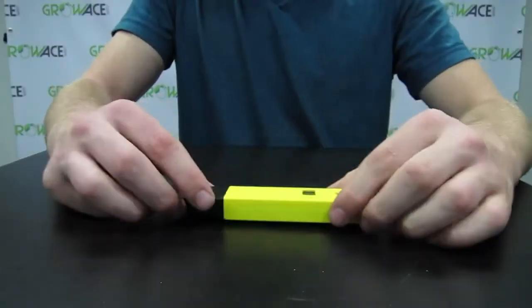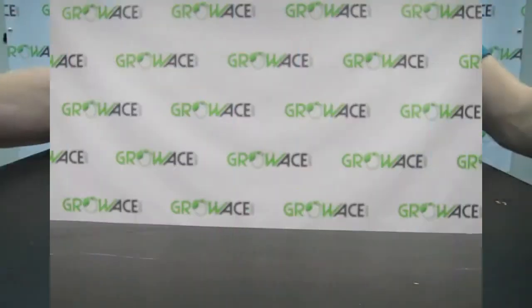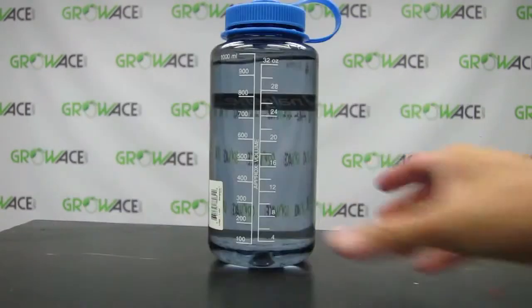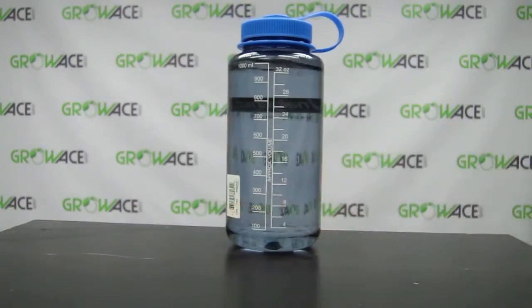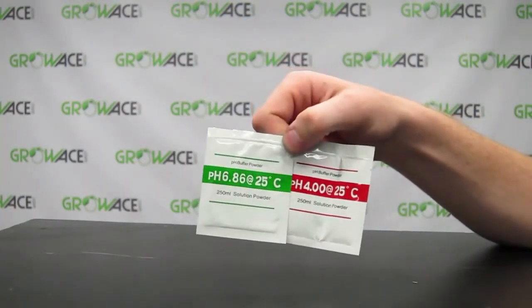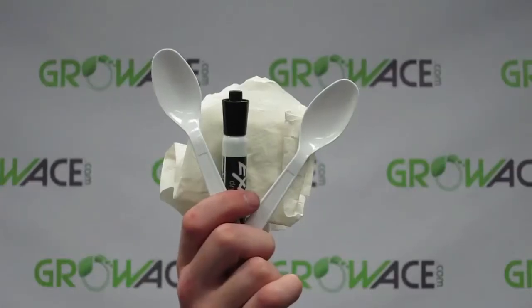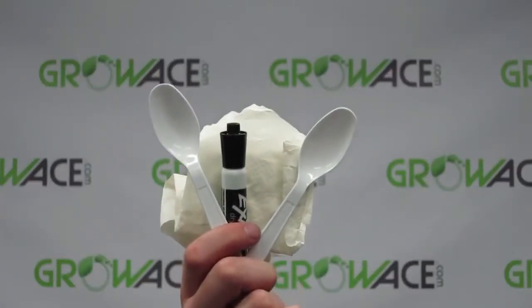Let's calibrate this pH meter. It's important to calibrate your pH meter the first time you receive it for an accurate reading. The tools needed are three cups, 1,000 milliliters of distilled water, the pH buffer packs that come with the meter, a small flathead screwdriver, a measuring cup, two spoons, a marker, and some napkins.